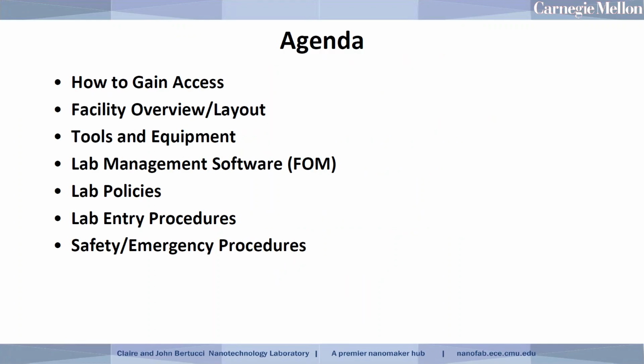Throughout this presentation, we're going to cover the following topics, including how to gain access to the facility, a general overview and layout of the facility, the tools and equipment that are in the facility. We're going to cover generally what our capabilities are. We're going to talk a little bit about our lab management software, which is critical to the operation of the clean room.